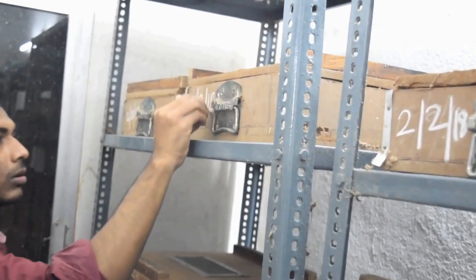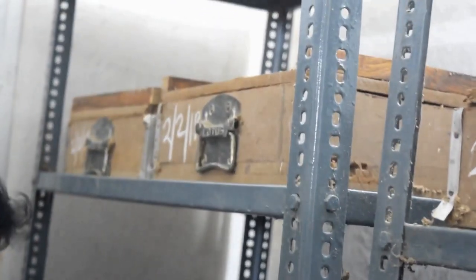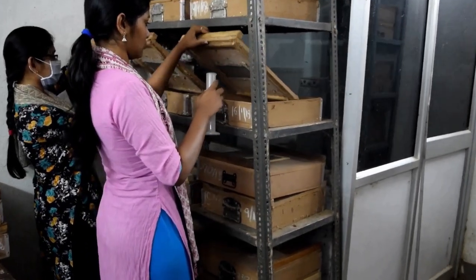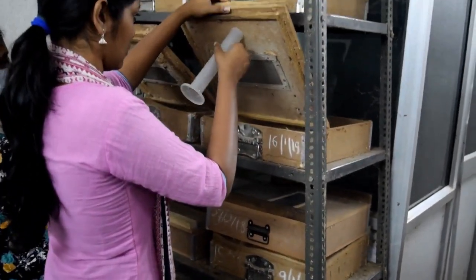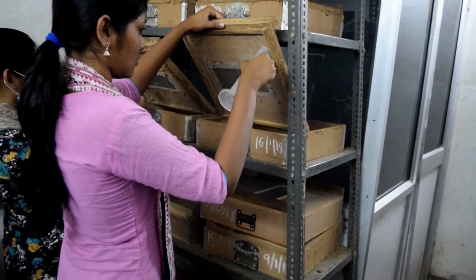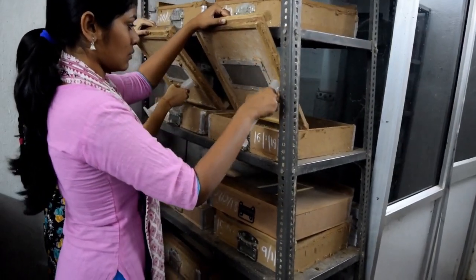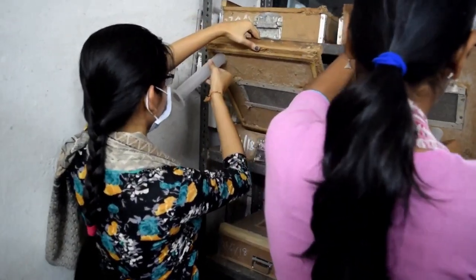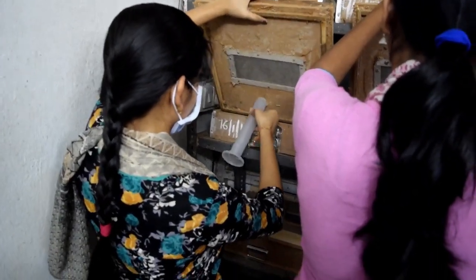Eggs hatch in 3 to 4 days, larvae feed for 30 to 40 days, and then pupate for 7 to 10 days. Adult emergence starts from 40th to 54th day. The moths are collected manually from the boxes with specimen tubes.